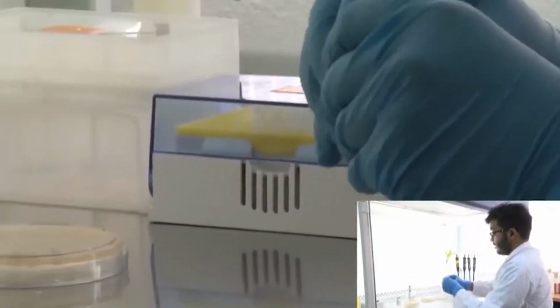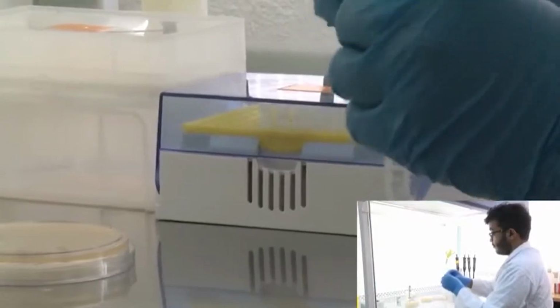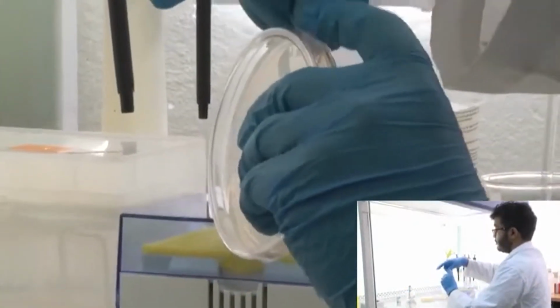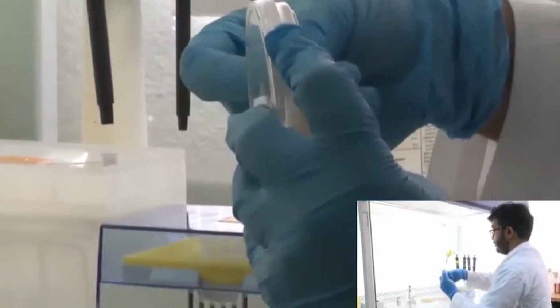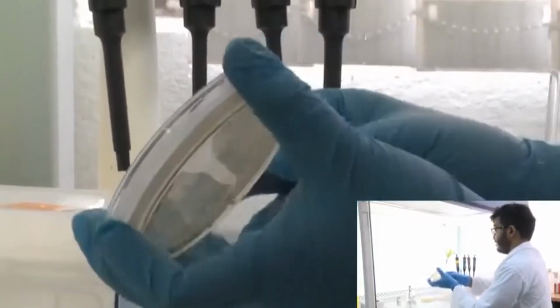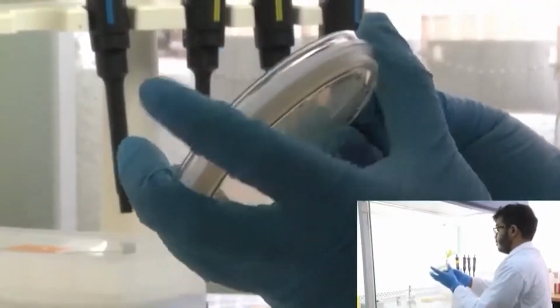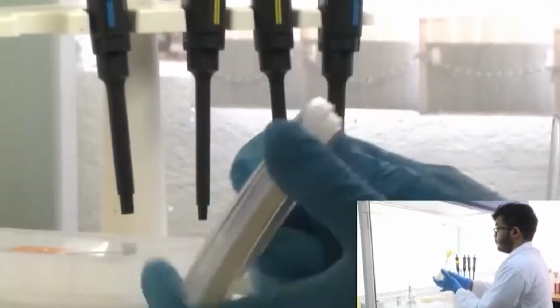For now I am just setting it aside. I will take another strip of parafilm, remove the protective cover, and I will store this plate as well. So it's basically a stretchable sealant with which we are sealing the prepared petri plates.